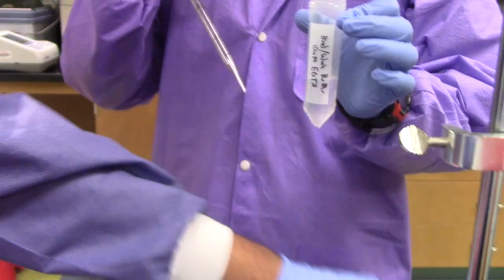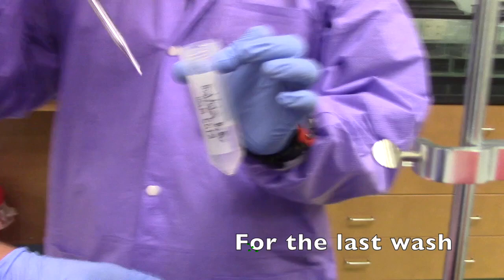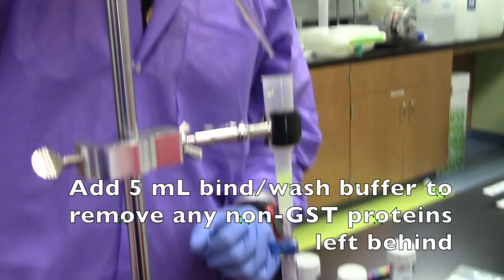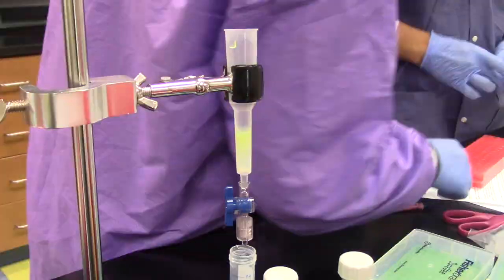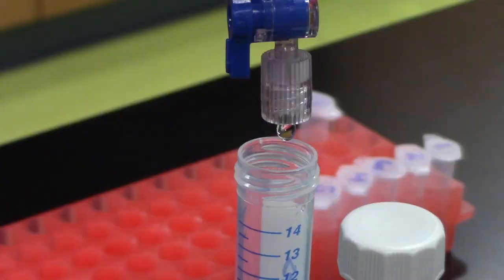For the last wash, add 5 mL bind wash buffer to remove any non-GST proteins left behind. Collect a 10 microliter aliquot from the last wash for fluorescence analysis.